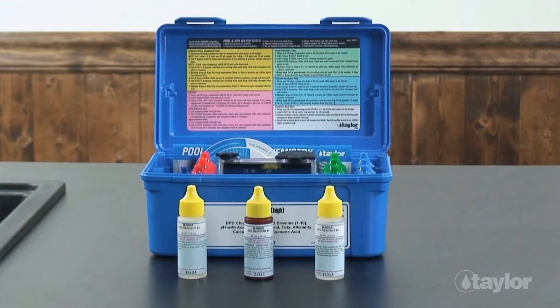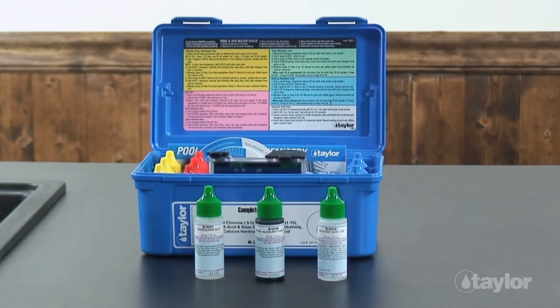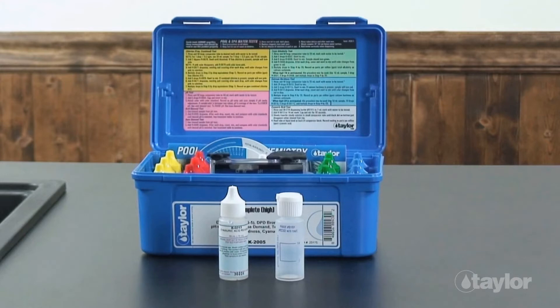Reagents come in three-quarter ounce bottles. The tests in the complete kit include high-range sanitizer, namely free and total chlorine from 0.5 to 5 parts per million, as well as total bromine from 1 to 10 parts per million, pH with both acid and base demand tests for adjusting pH, total alkalinity, calcium hardness, and cyanuric acid for outdoor pools and spas using this chlorine stabilizer.